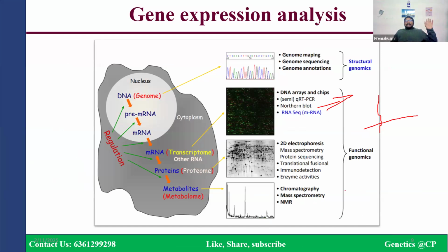See, the real time I'm talking about is not in-plant expression. Real time means we get the result while the PCR is running. In normal PCR, you have to wait for the PCR to be completed, then take the PCR product and load it into a gel, then see the bands.